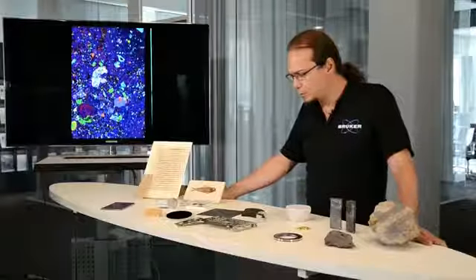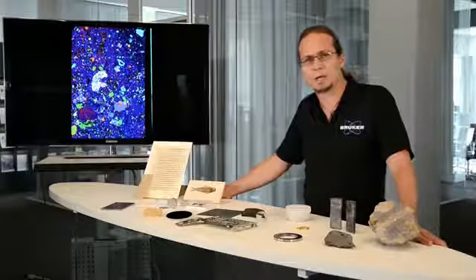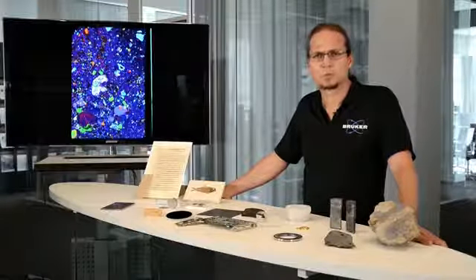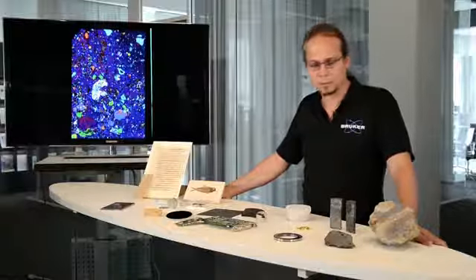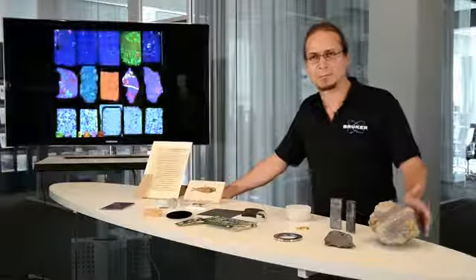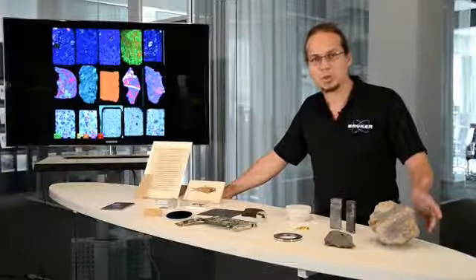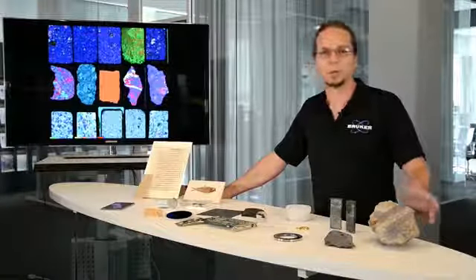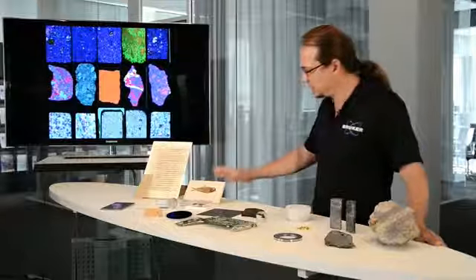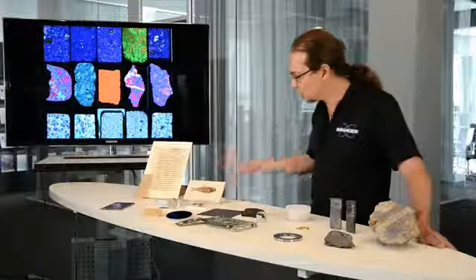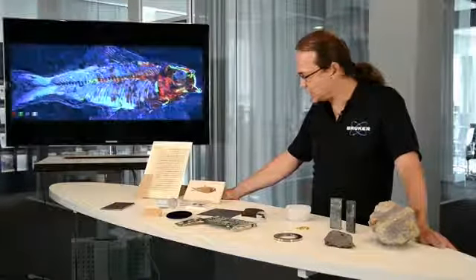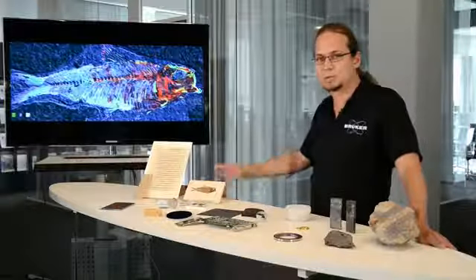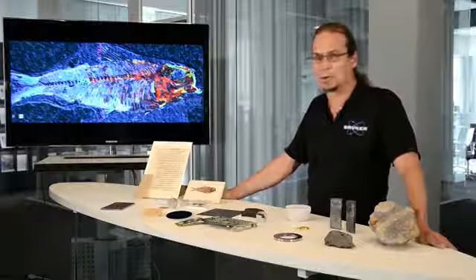Another important thing to point out for micro-XRF is the non-destructive approach for sample analysis, which means we can just place the sample as it is into the machine and get information about the element distribution without requiring any previous preparation. We can use, like in this case, a fossil fish and determine what are the elements in the fossilized material without doing any additional preparation to the sample.